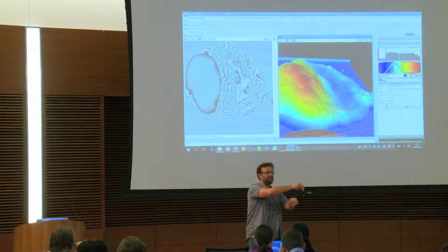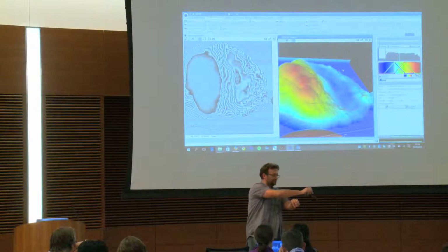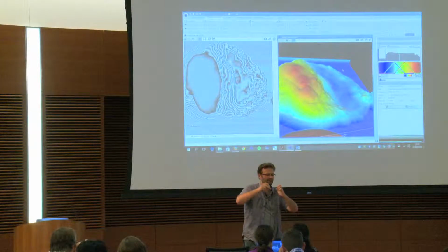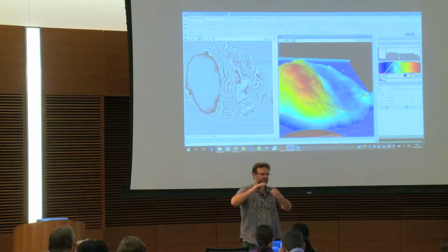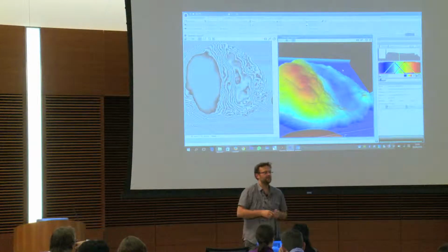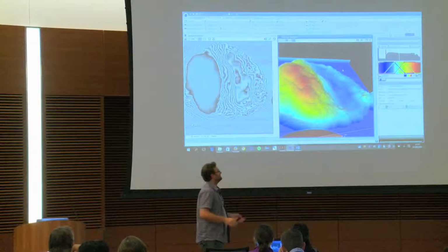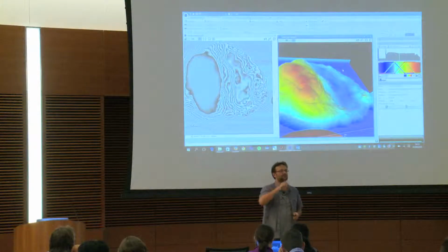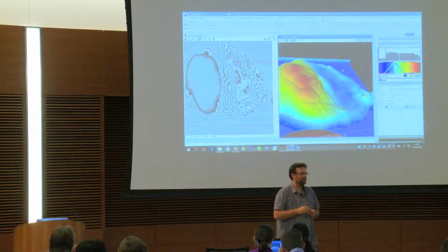It cannot be like that for the same reason, so it has to have an angle. So you go like that, and you do this. But if I have something very cleanly, sorry about the English, if you do this, here you have a shadow area. I cannot scan what is here. So now you have another answer. You know that this sample has been scanned from here to here, and there is no go back and forward.